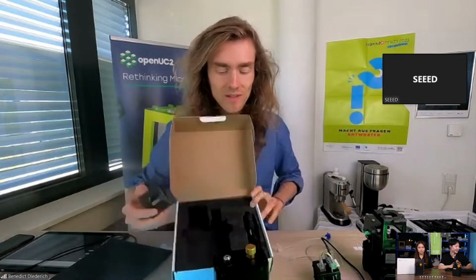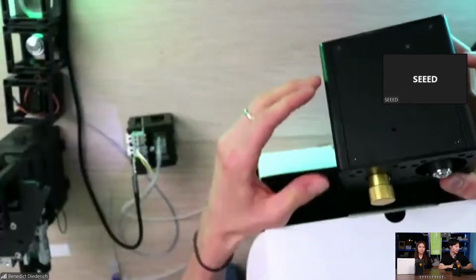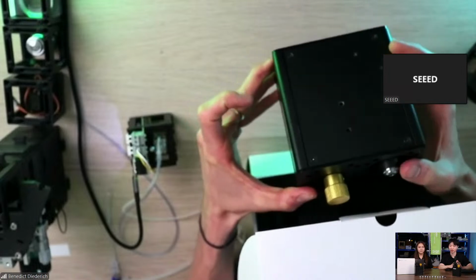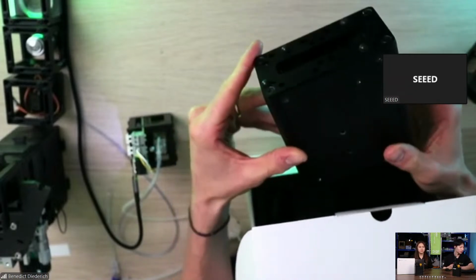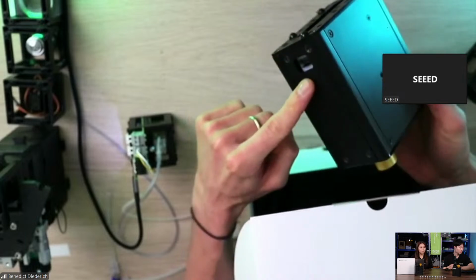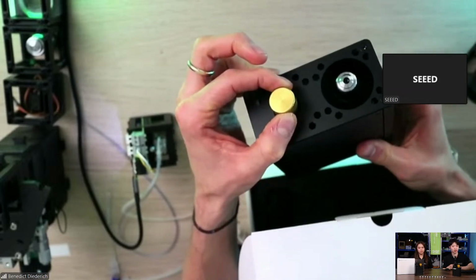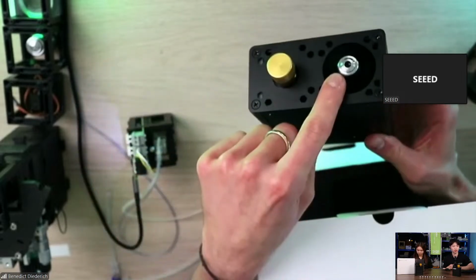So you have this black body here, which, if I go over to the other camera, the little piece here. Below here, you see that there is a cooling body. This will host the camera, the Xiao camera. And this here is a micrometer precise focusing knob. So why would you need that? Well, there's a little microscope lens here.